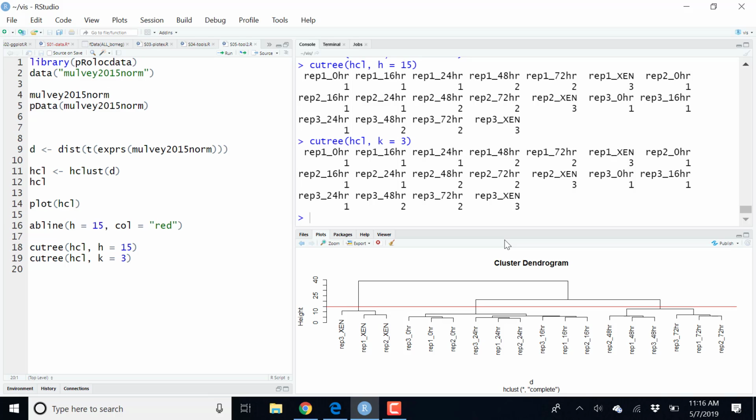If you have another one, feel free to use another one. But what would be the clustering that I would get if I wanted to have 5 clusters? How would my clustering result be? And how could I find, based on this hierarchical clustering, the 5 possible clusters to identify?